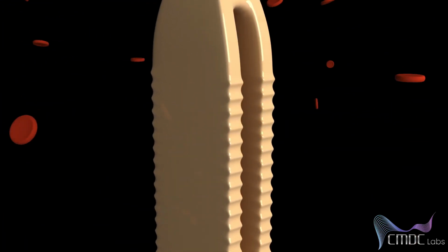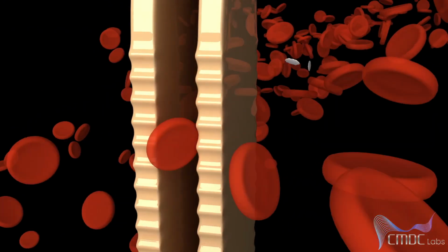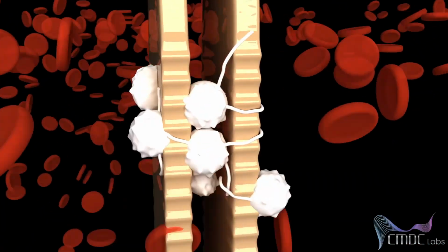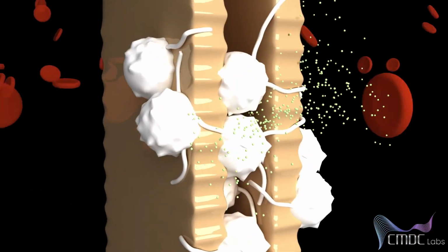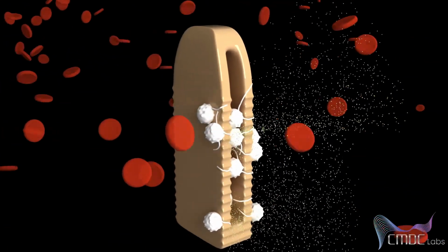Platelet fibrin red blood clot formation continues through a fibrin monomer cross-linking process, which forms an implant-adherent 3D provisional matrix. The CT chamber model-driven design allows a provisional matrix scaffold to be evaluated for the production, release, and regulation of a number of different cell signaling molecules that are necessary for the ensuing bone regenerating processes.